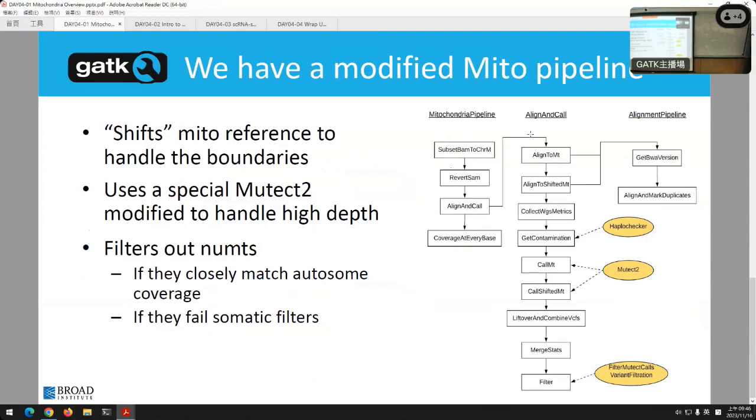But also, so as I mentioned, the depth can get crazy on mitochondrial DNA. Like, it's one thing to look at a 30x coverage in a genome. It's another to have, I don't know, 25,000 depth. And things happen when you have that many reads. Weird things happen. Like, when you think about 1 error per 1,000 bases, just in sequencing, how does that add up when you have 25,000 separate reads? The sequencing errors are no longer a trivial fraction.